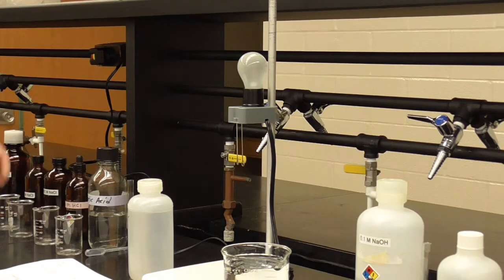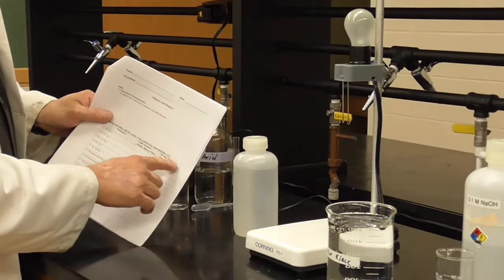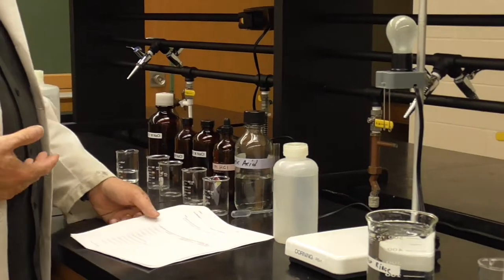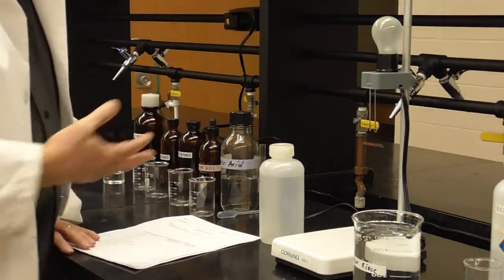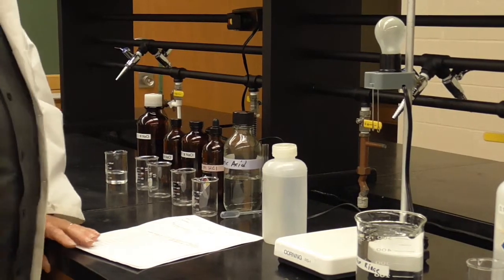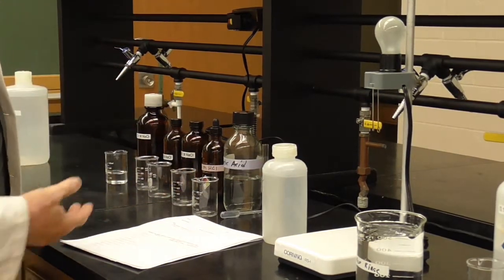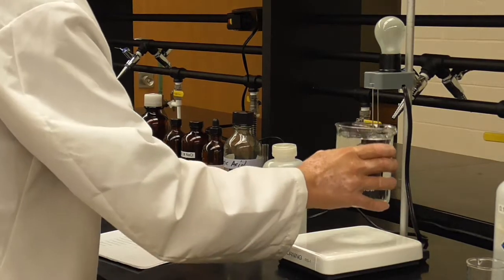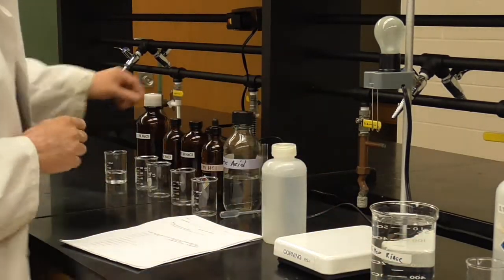All right, the rest I'm not going to classify. I'm going to let you classify it as strong, weak, or non-electrolyte. So a strong electrolyte is like what we just saw. A weak electrolyte, well, just a little bit of electricity would flow, and so the light would go on, but maybe not so bright. A non-electrolyte does not allow the electricity to flow, and so the light would stay off. All right, so I will rinse this off. I just got some DI water here just to make sure that our contacts are clean between each trial.